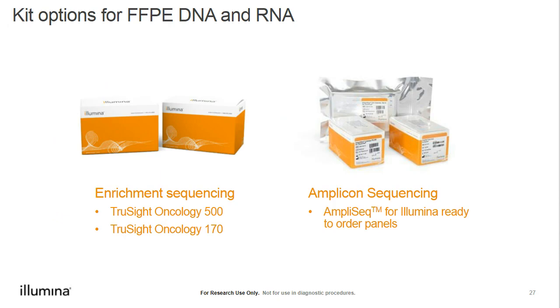So finally, we do have some options that look at both FFPE DNA and RNA simultaneously. And these are all going to be targeted approaches, either enrichment sequencing with TruSight Oncology 500 or TruSight Oncology 170, or AmpliCon sequencing options, specifically AmpliSeq for Illumina panels.